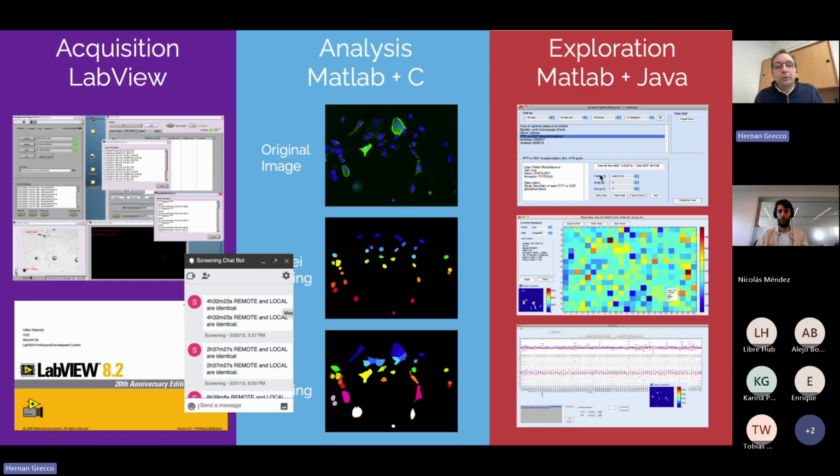So I decided to do something with this, which was basically try to generate a single unified code base to do all these things, and at the same time reduce the time of acquisition of the whole microscope, which I took from something between 30 and 40 hours to less than 15. Okay, and the missing part to be able to achieve that, when I started to analyze the ecosystem, I realized that Python, which already in 2007 was looking at the future to be the programming language of science, there were really good libraries to do data analysis.